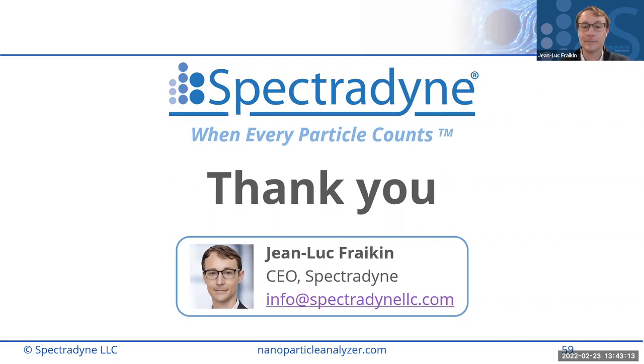Hi, can you hear me? Yes, we can. Hi, Jake. Okay, hi. Yeah, thank you for the talk. I've recently become aware of another RPS-based company that advertises the ability to measure individual particle zeta potential, and I'm wondering if you can do the same with the NCS1. Good question. So I think I know the company you're talking about.